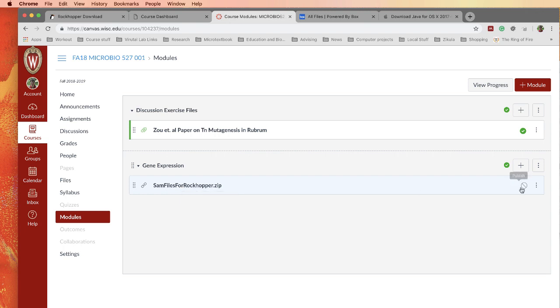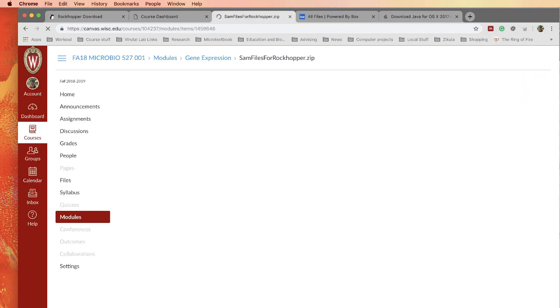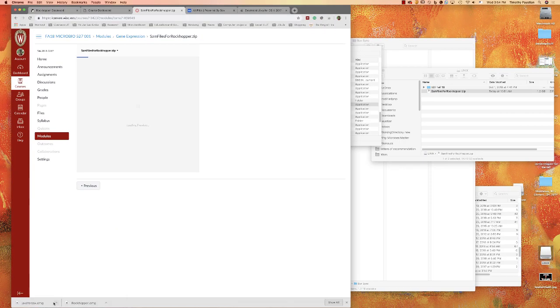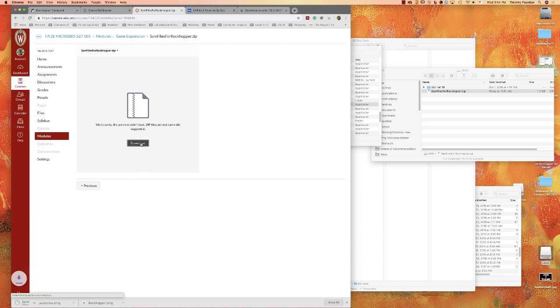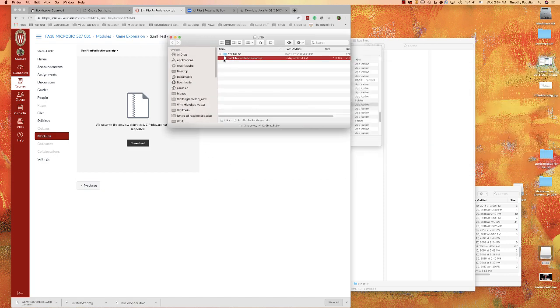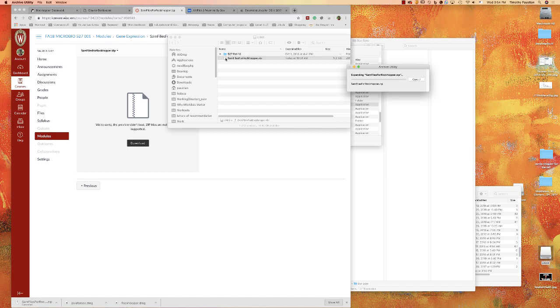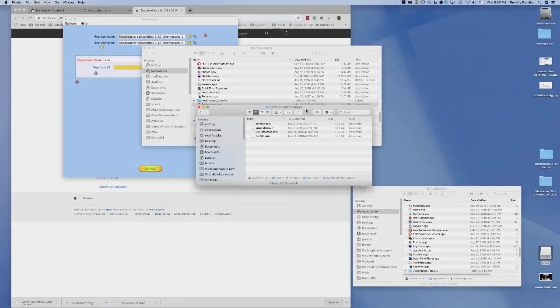They have SAM files for RockHopper.zip — that's a type of format that is readable and usable by RockHopper. I'm going to cancel this download because it takes forever; it's going to take about six minutes. I already have the file right here on the desktop. I'm going to double-click on this zip file and it will expand the SAM files for RockHopper — this takes a while so you're going to have to be patient. The files have now expanded and they are in a folder called SAM files for RockHopper.